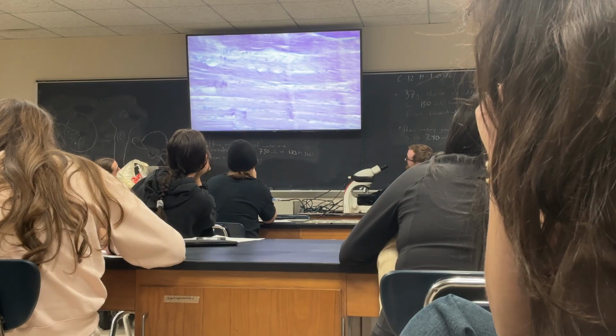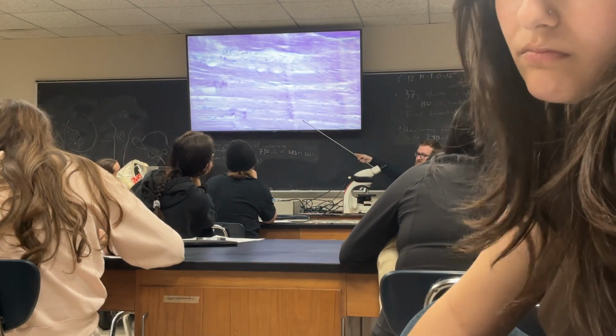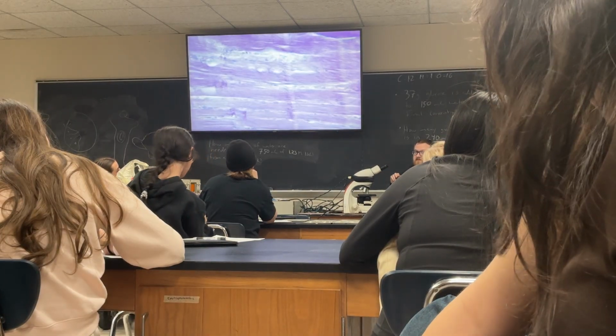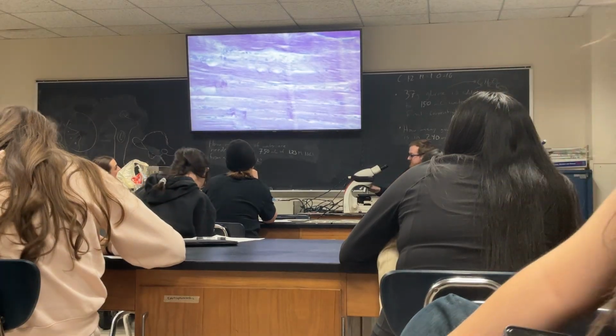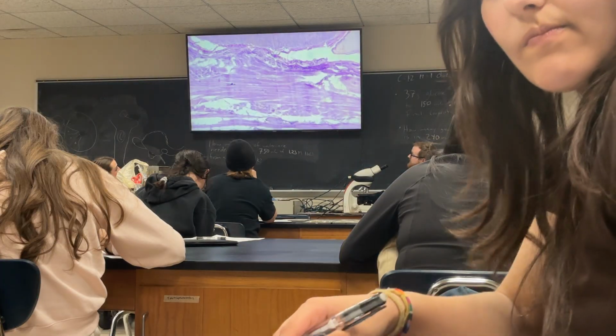I mean, yeah, okay. Down here you guys see the vertical stripes? So there's some striations. But even then it's pretty rough to tell, and at the back of the room you may not even see those, okay? But I can still confidently say this is skeletal muscle. Because if I back, that was my highest magnification. If I back this off to pretty low, what do we notice?